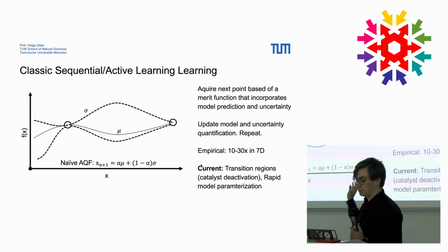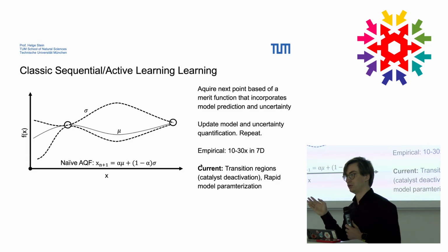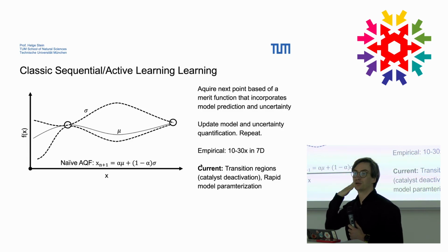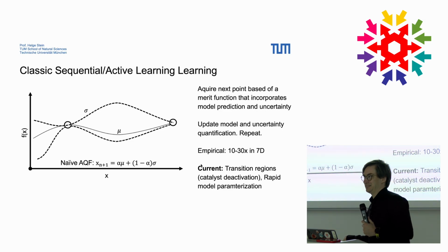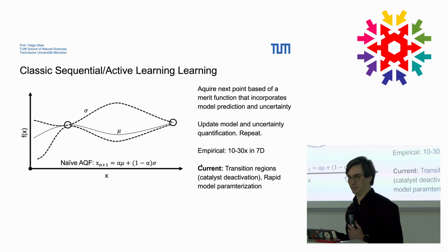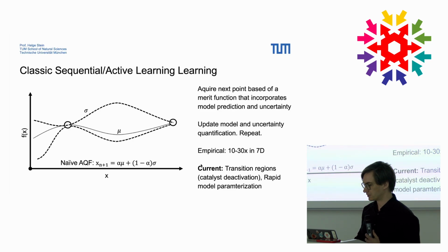If you do that, empirically what we find is you can get an acceleration factor of roughly 10 to 30 times, which is still crazy, because think about the fact that we typically do 2,000 experiments. If you just do a 30th of this, for me this wouldn't even be high throughput anymore. You can almost do a couple of dozen experiments manually. So what you essentially do here is you measure, you ask your model, hey, where should I measure next? Where are you uncertain? What is the space-filling design? And then you repeat until you're satisfied with the result.